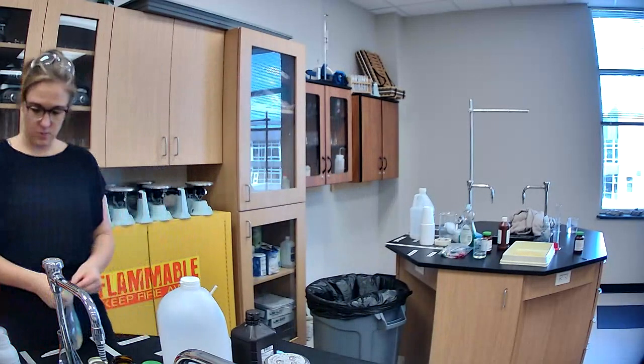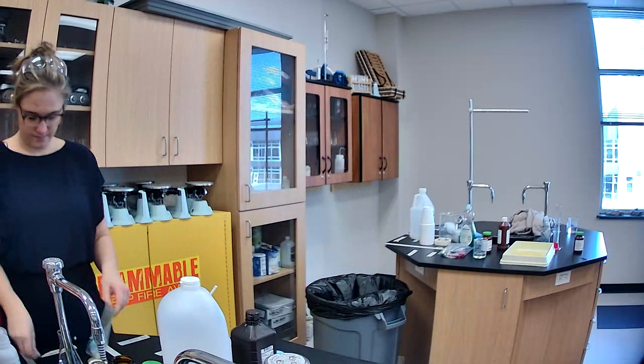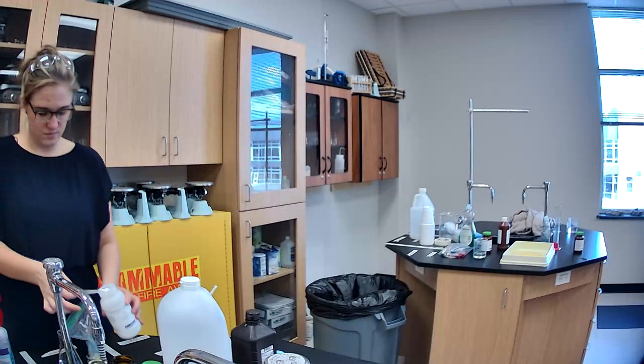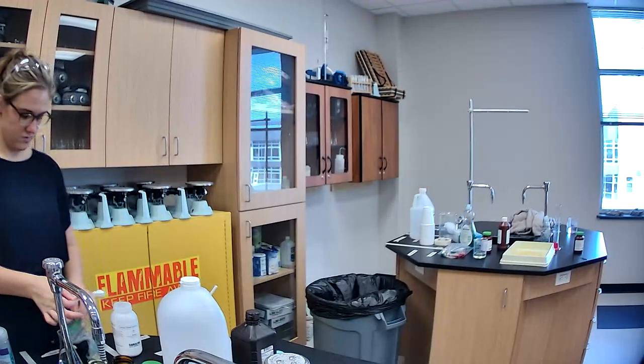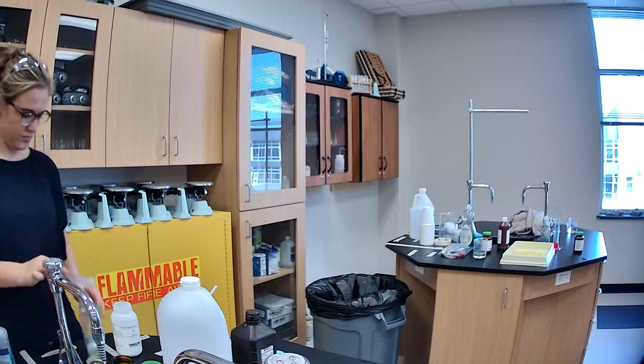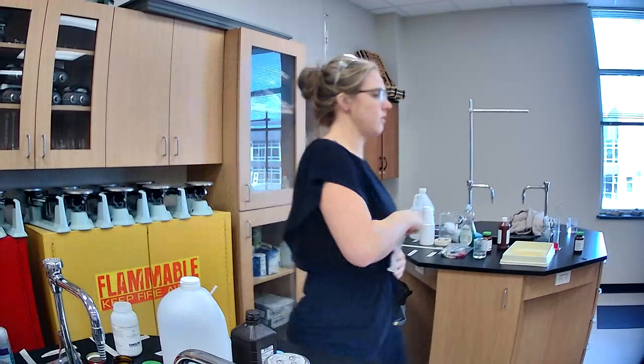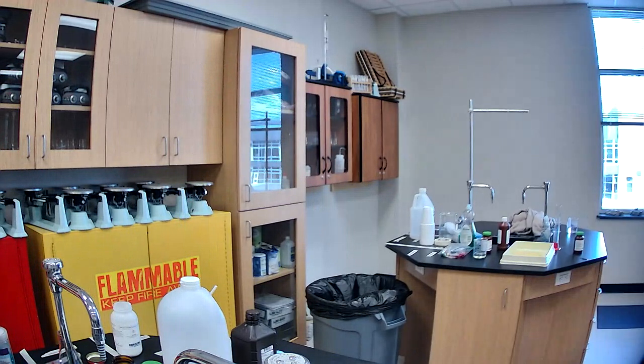Maybe we should add some more. Add more time to make it burn. I want them to be able to feel. Alright. There you go.